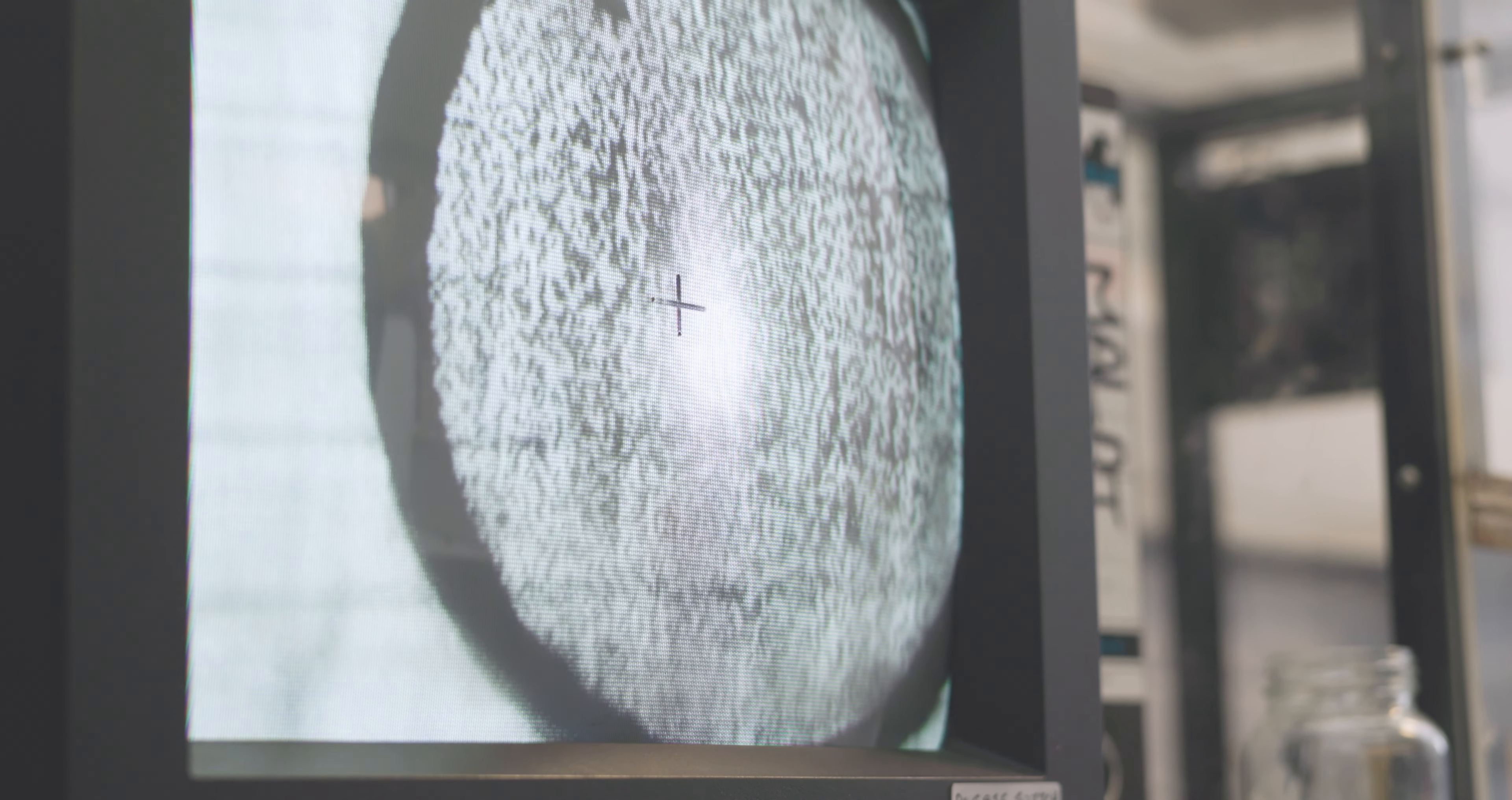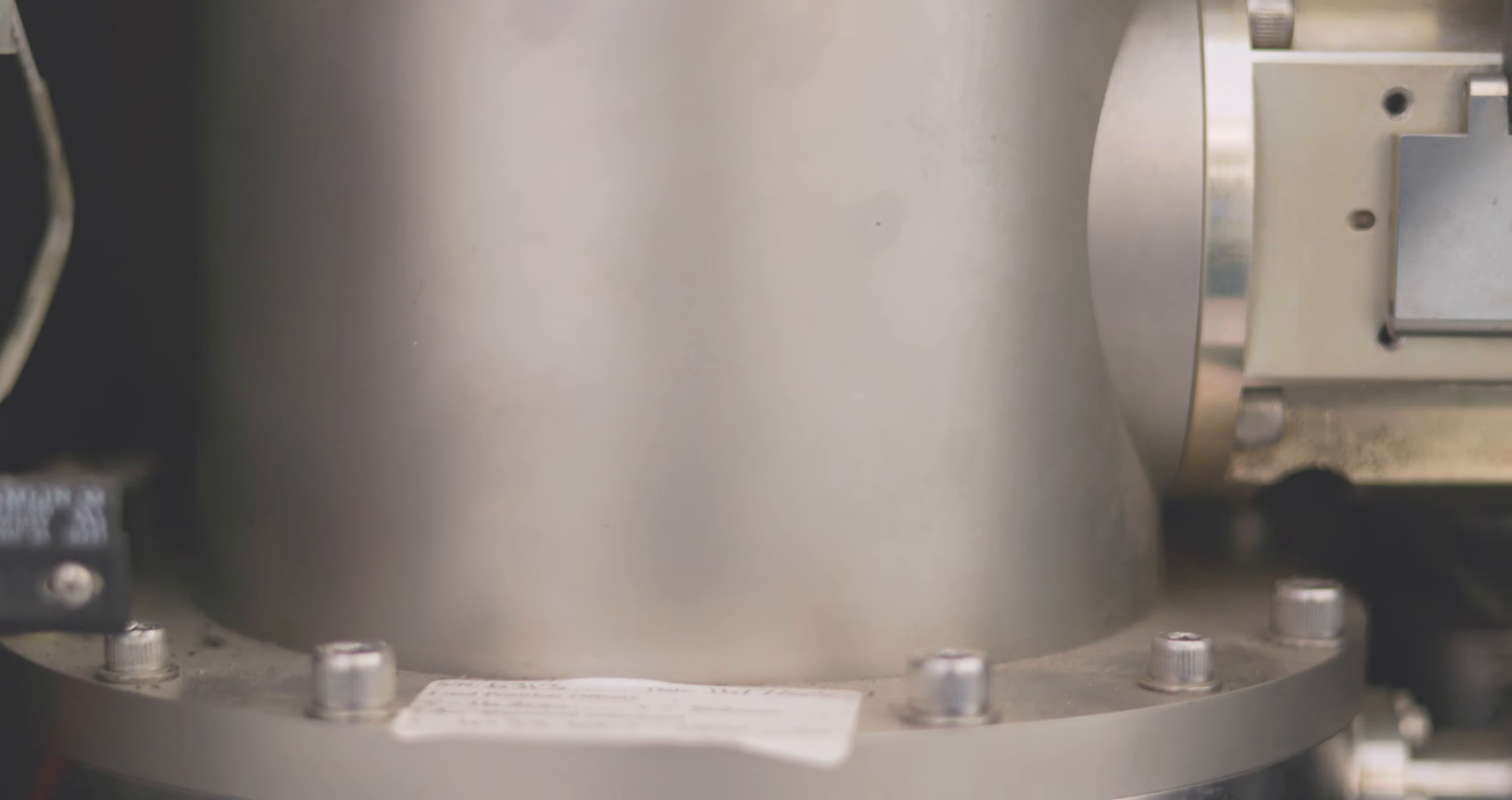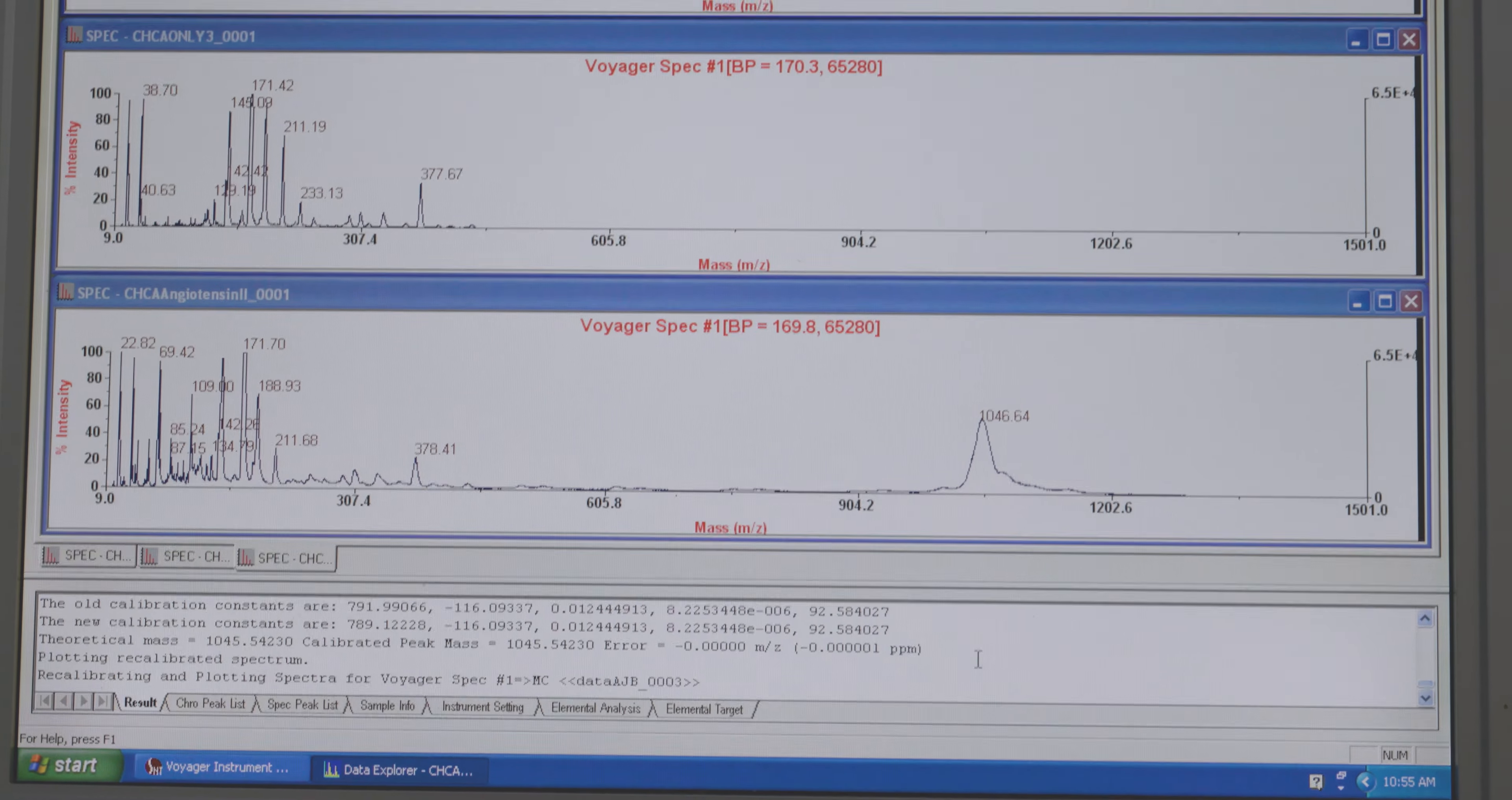You can see that flashing, and that is the pulses of the laser ionising some of our sample. These ions travel through this long tube in the mass spectrometer and get separated out by their mass, or their mass to charge ratio. We then end up with data where we can see the mass of our protein, and we can also see many other peaks from our matrix itself.